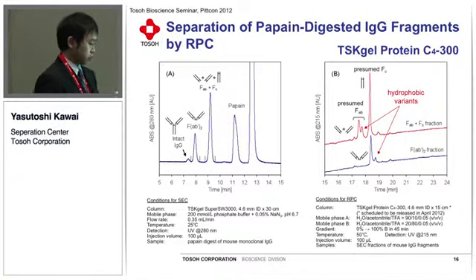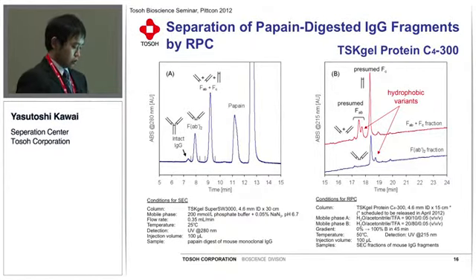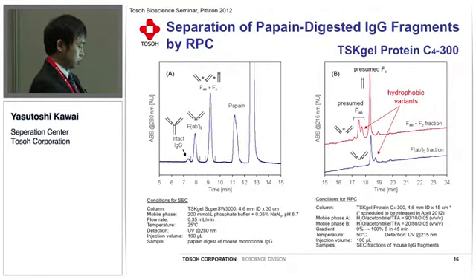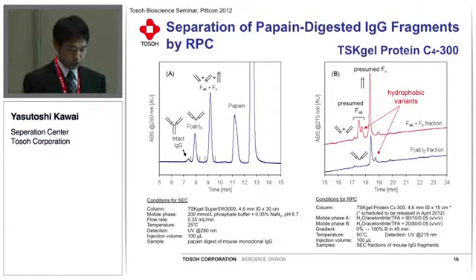Here you find that several peaks appeared in each chromatogram, indicating that the antibody used in this study was heterogeneous in hydrophobicity, although the molecular species in each peak was not determined yet.